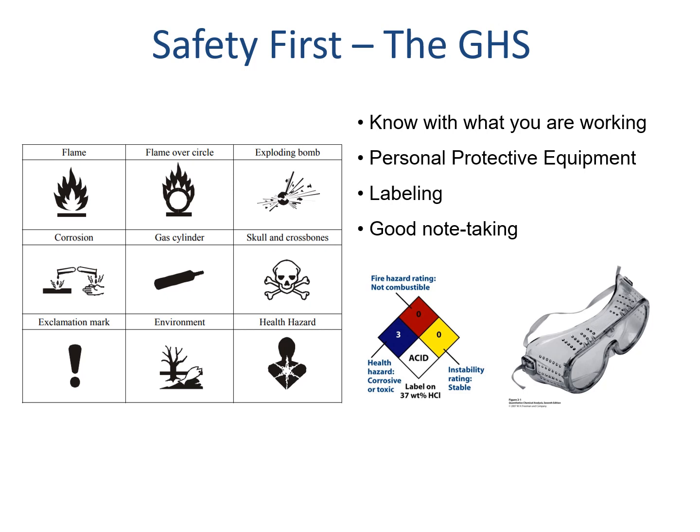In addition to these, we will always wear goggles, clothing that covers our legs, and closed-toed shoes. And most of the time, we won't eat our reagents.